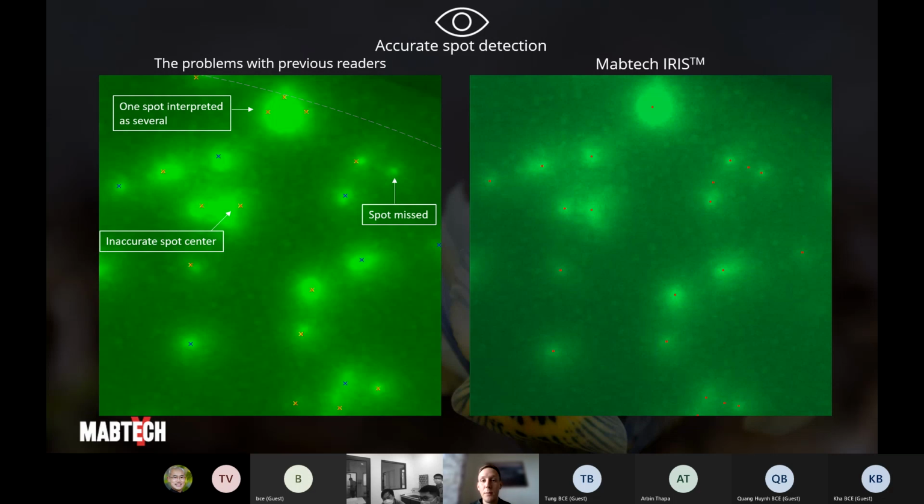And in short, it basically means that we are performing simulated modeling of the entire process. So we can backtrack where the cell started to secrete cytokine and the entire diffusion process of the cytokines being released from the cells. And then that allows us to go back and backtrack the origin of the secretion. So it's advanced mathematics, while this is a simpler way of performing image analysis.